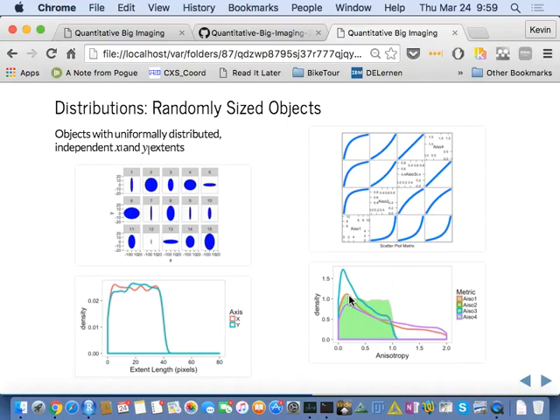This is the scatter plot matrix, which shows you the first one versus the second one, the first one versus the third one, the first one versus the fourth one. And then this value down here where you see the distribution of anisotropy for all of the samples that you're looking at. And so here you see that these curves do look quite different, and which of these curves best represents what you're trying to see in your image. So again, if you have an even distribution in the lengths of your objects, do you want to have an even or mostly even distribution in your anisotropy or not?